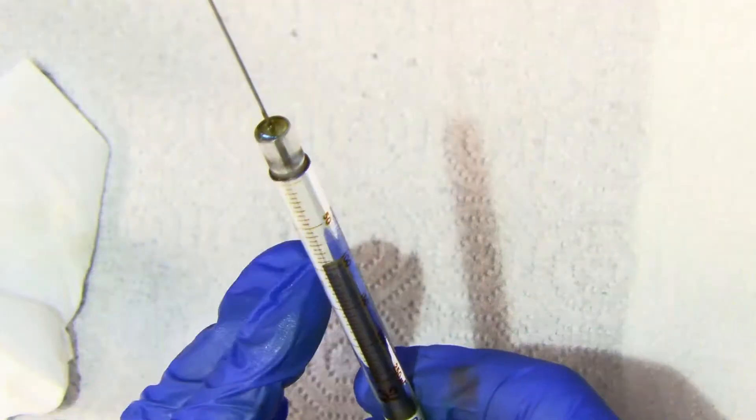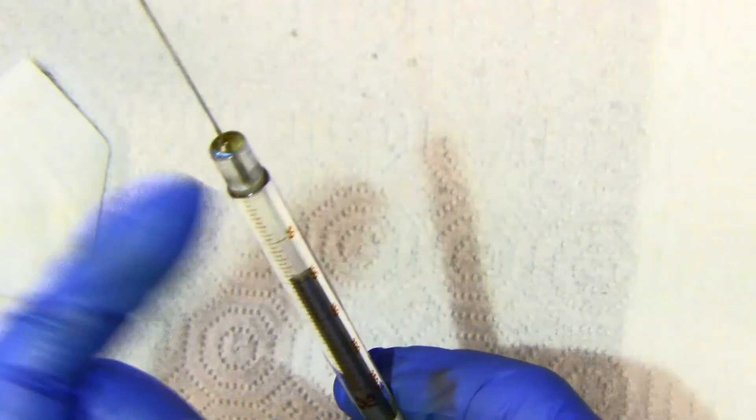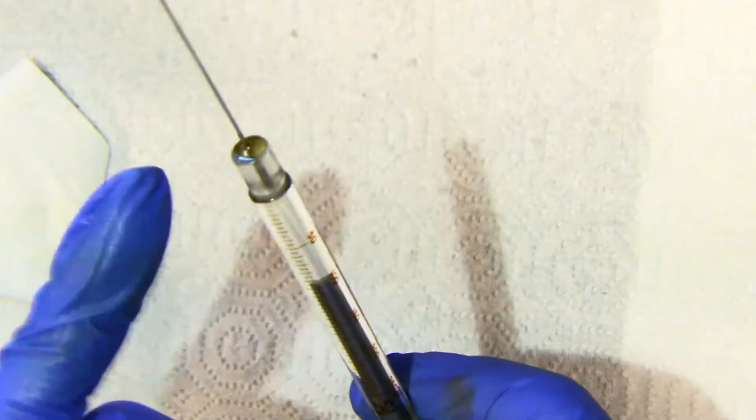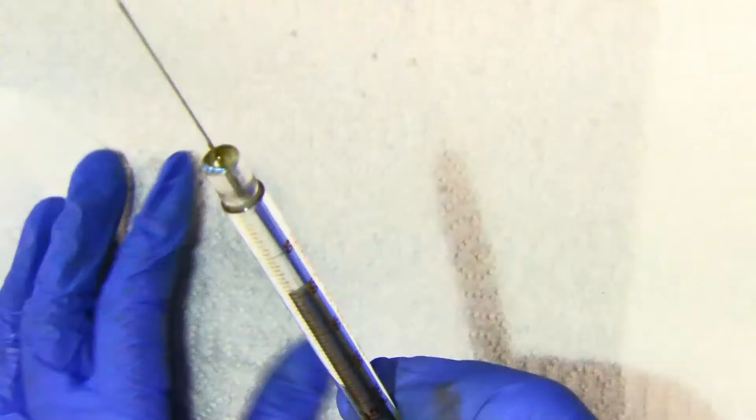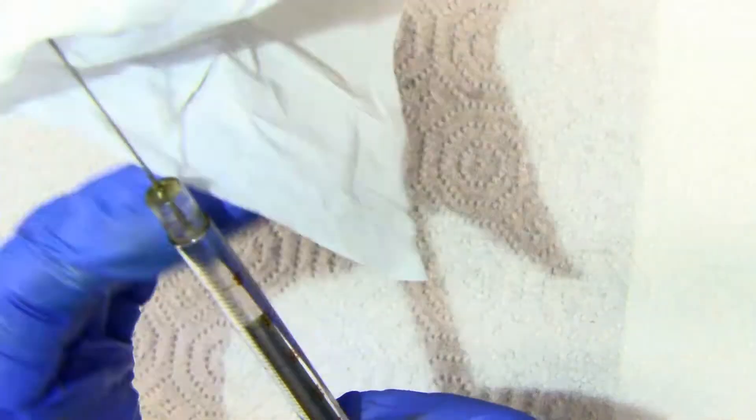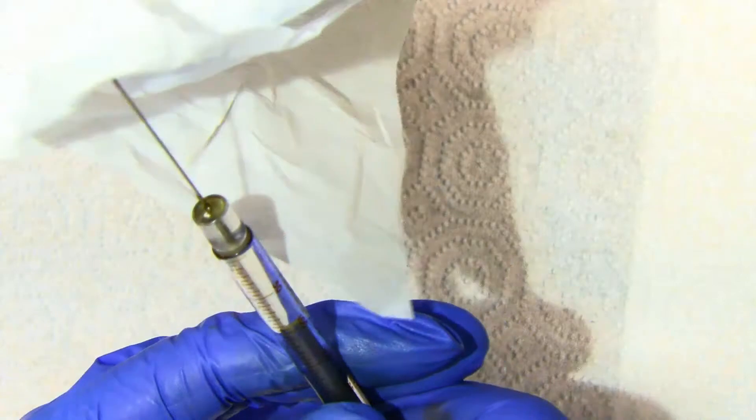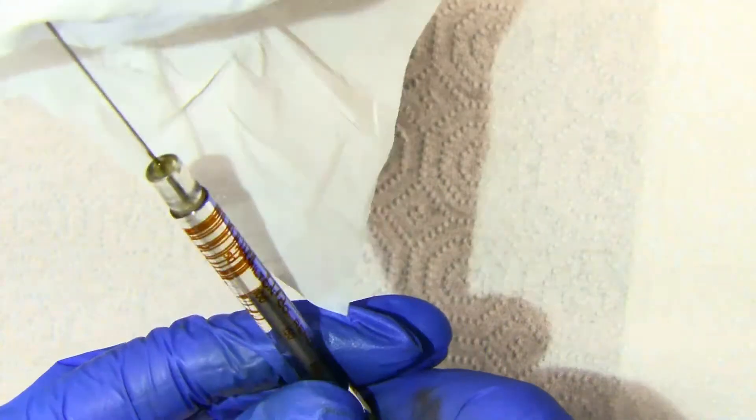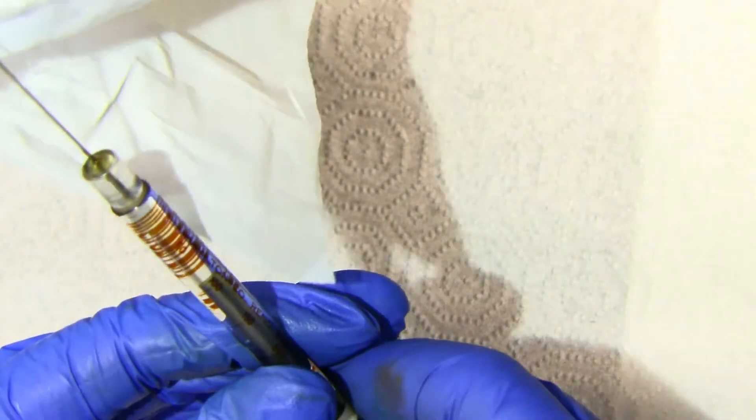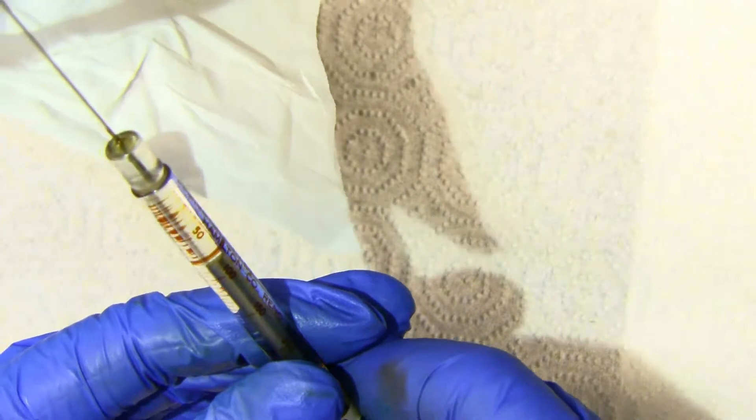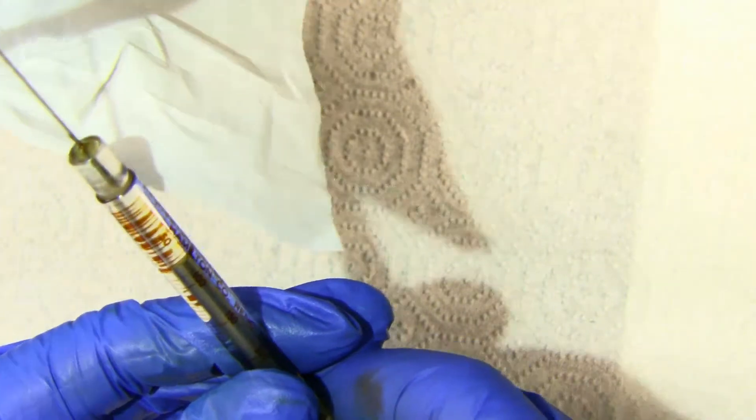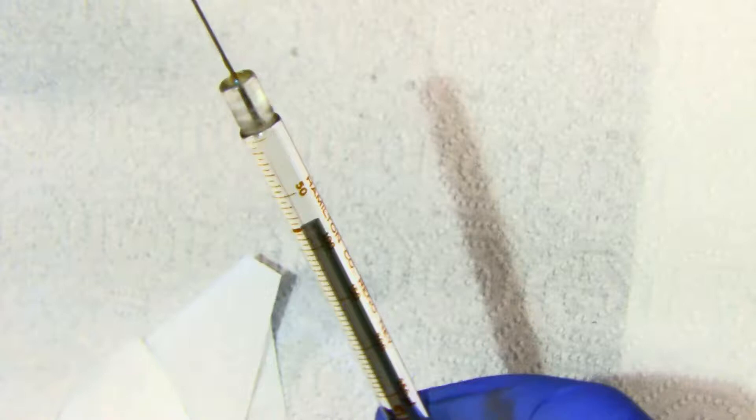With the needle straight up, you may have to tap to get the air bubble up to the top. Once you do that, put a little chem wipe over the end and eject until you get to the amount that you want. The excess will be coming out in the chem wipe. Make sure you have your syringe pointed away from you.